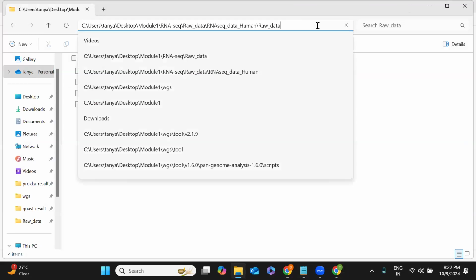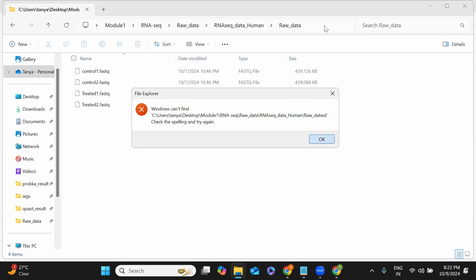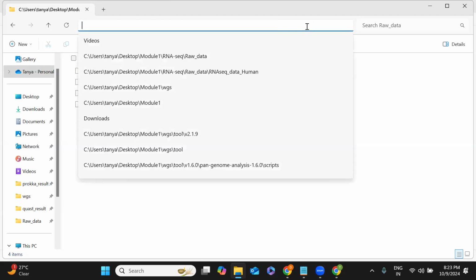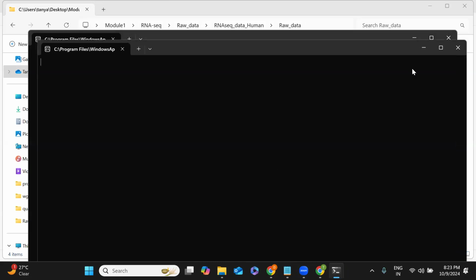Just open the WSL from here. So at the end, I will share this script also.